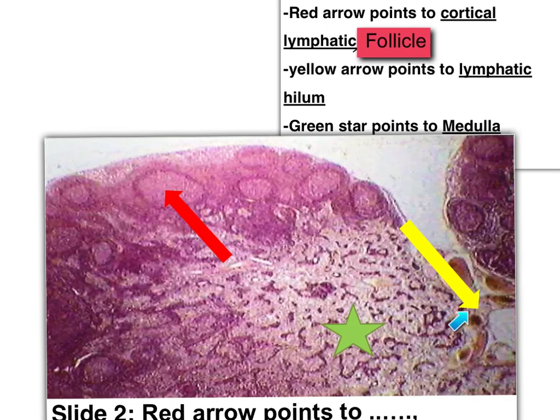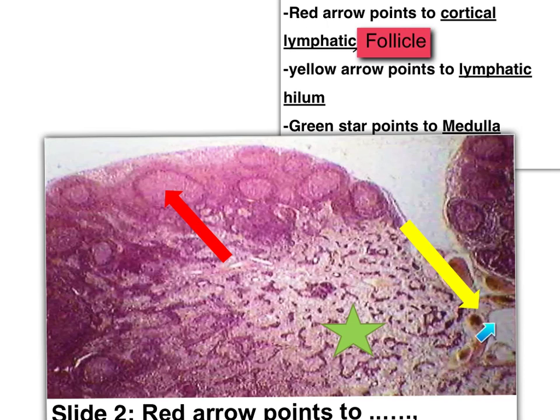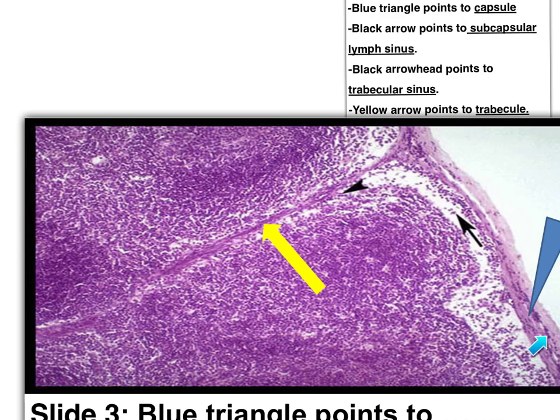The yellow arrow points to the hilum — this is the concave area of the lymph node. This is the cortex and this is the hilum showing the blood vessels and the efferent lymph vessel carrying the filtered lymph. The green star points to the area of the medulla. The blue triangle points to the capsule, the black arrow to the subcapsular sinus, and the black arrowhead to the trabecular sinus.